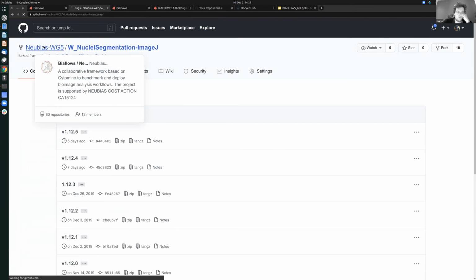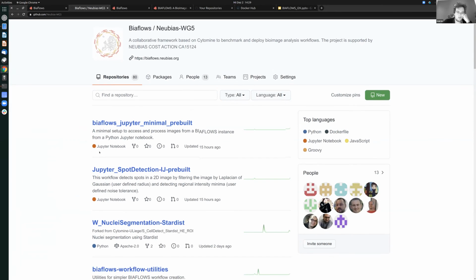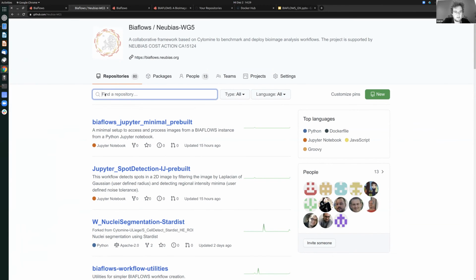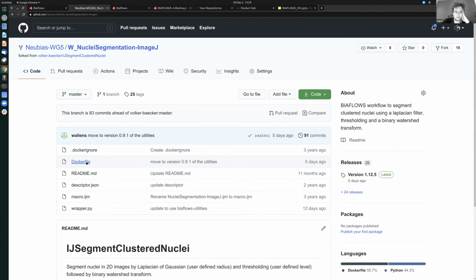And to make it work, we will explain how to do that in the hands-on from A to Z. So I'm sure it will be clearer for you. But basically, it also relies on these Dockerfiles where you have to specify all the libraries that you need. But once you do this configuration of trusted sources, etc., once, you will be able to automatically inject new workflows into the system.